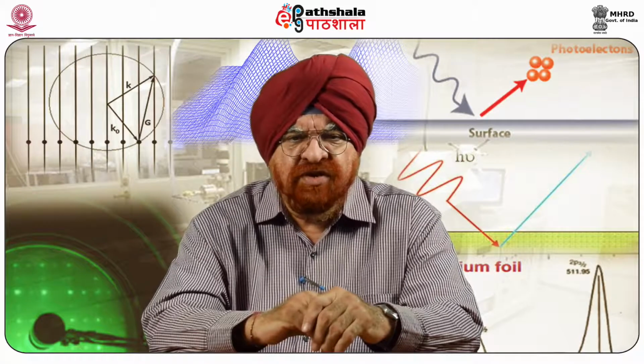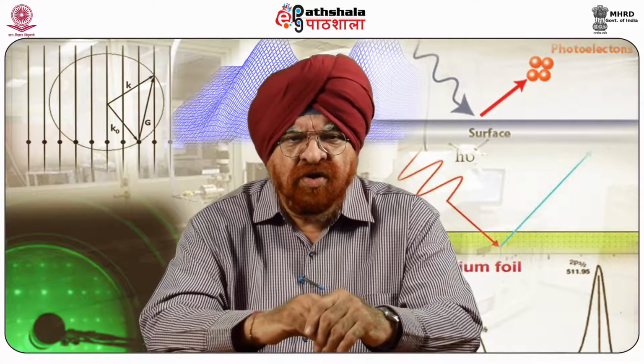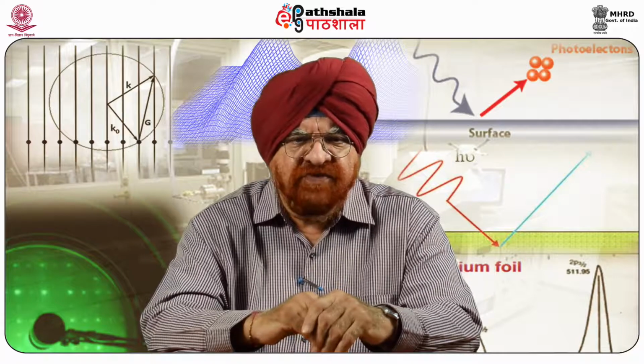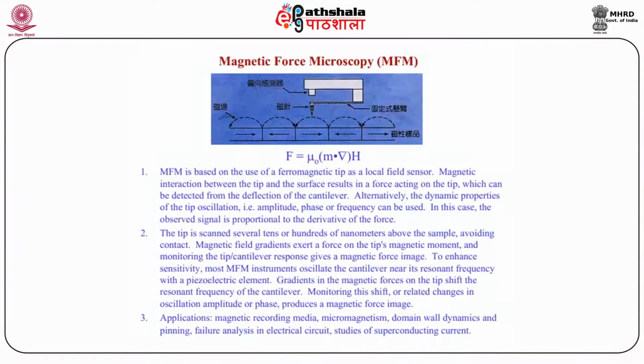MFM scanning often uses non-contact AFM, abbreviated as NC-AFM mode. This gives a mathematical relationship and shows in what way the tip scans the surface and these forces are measured.